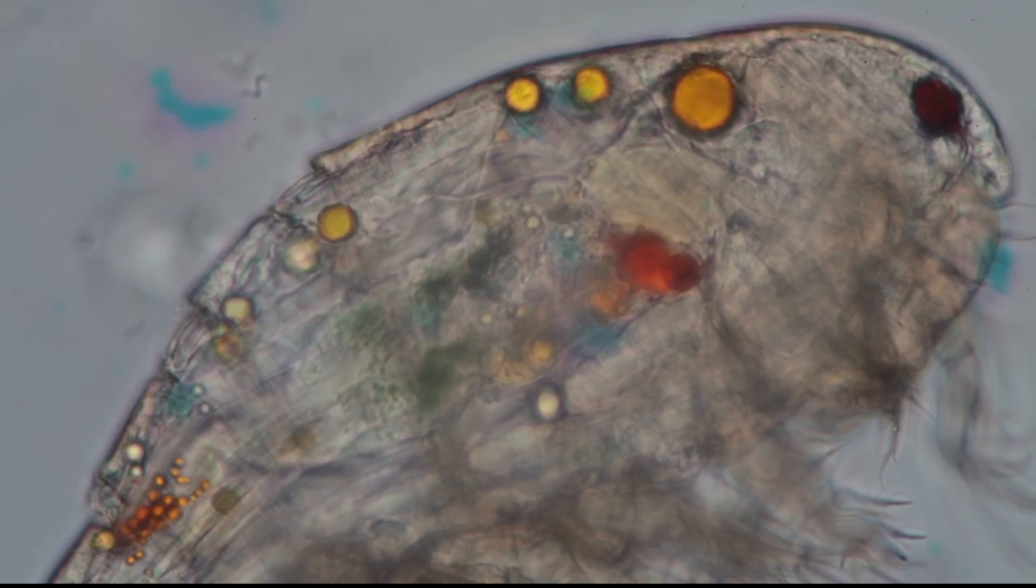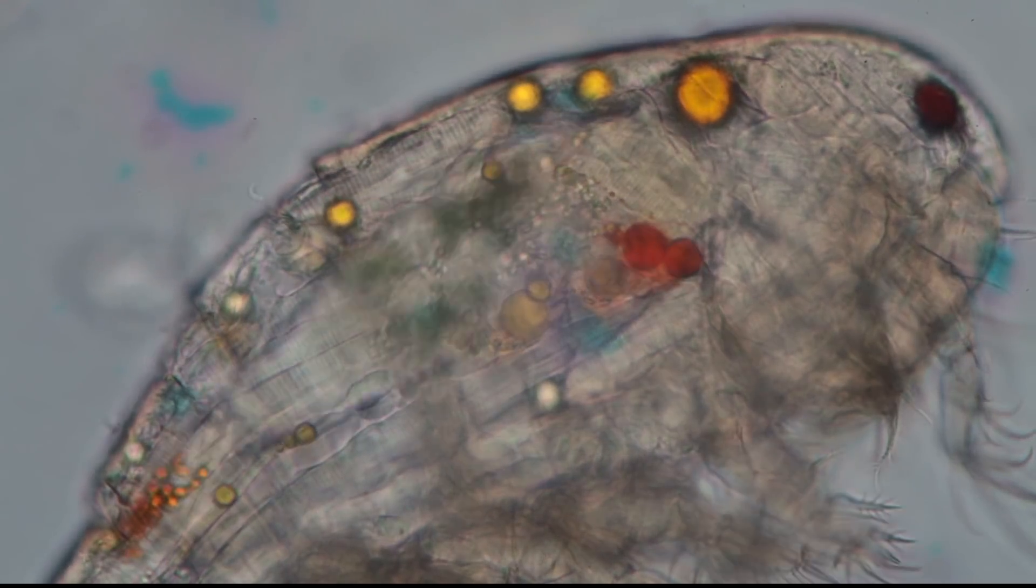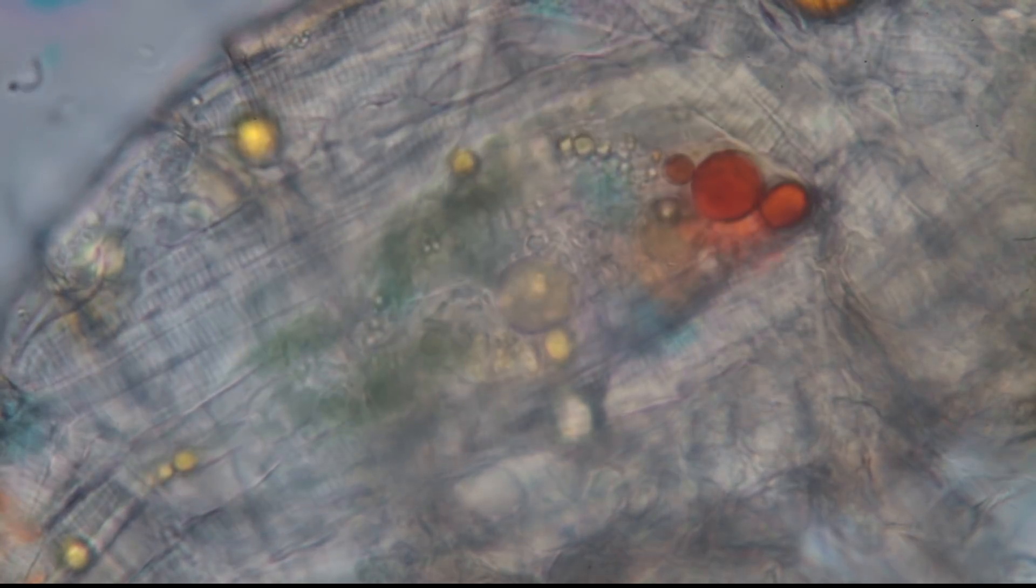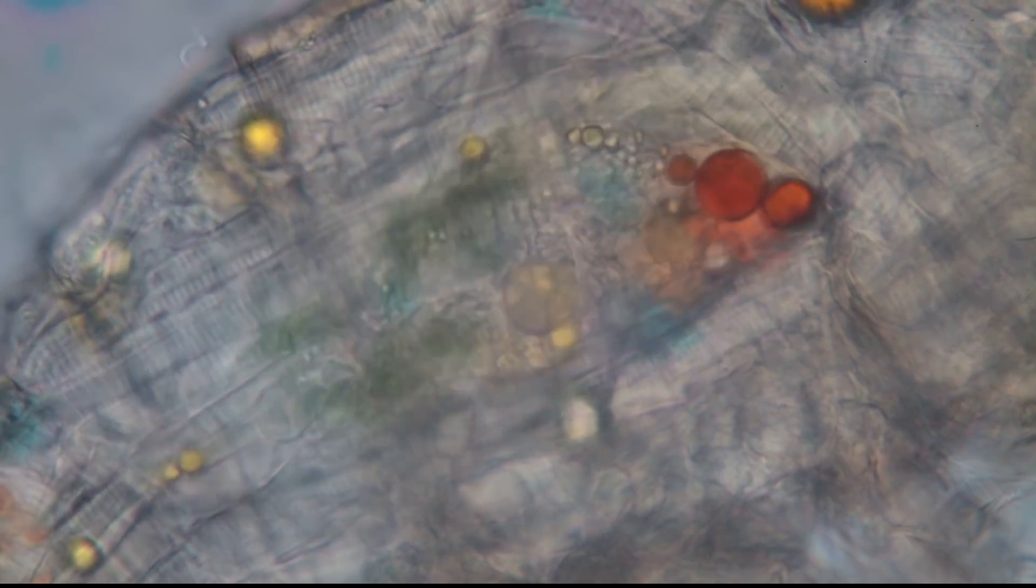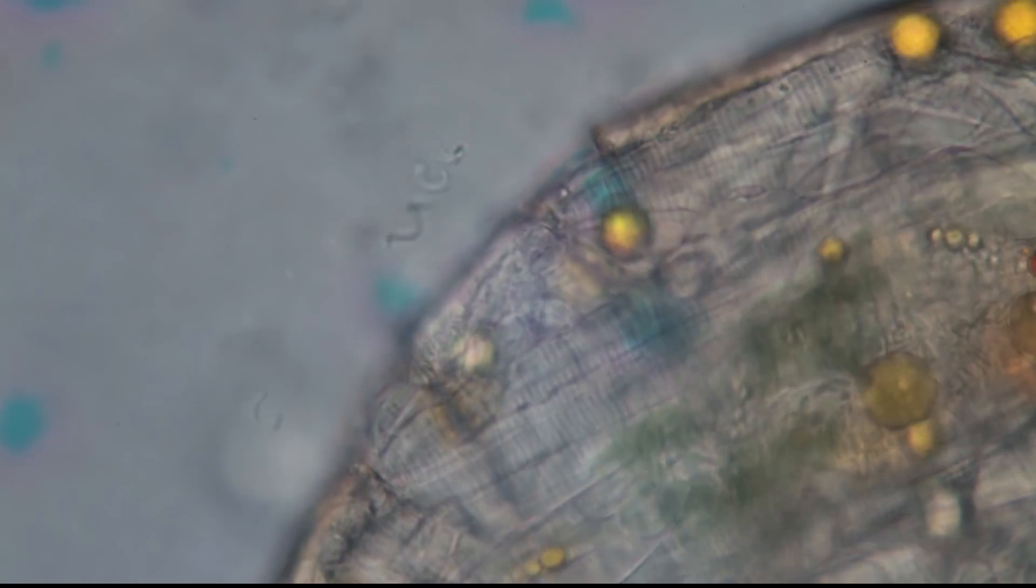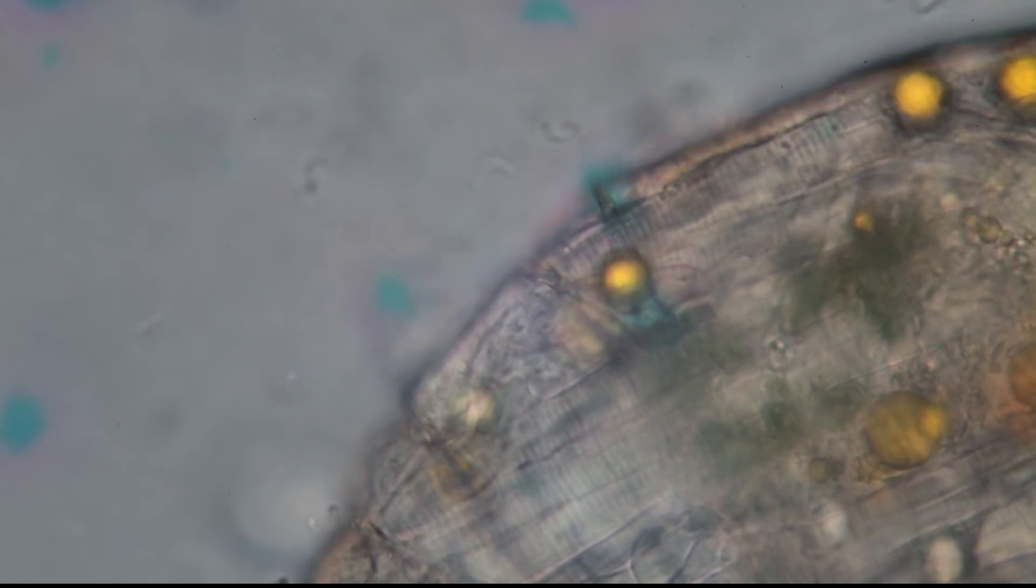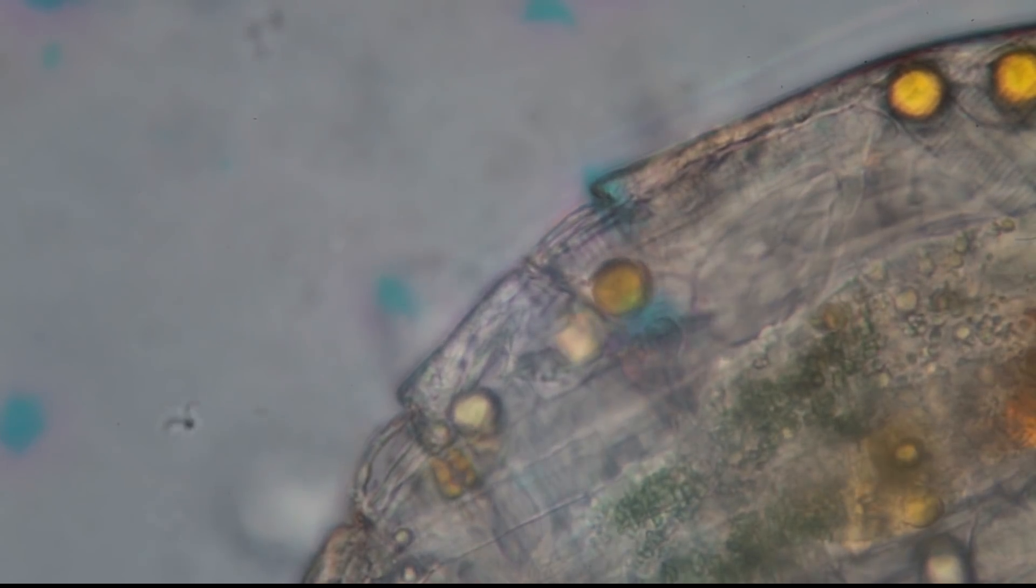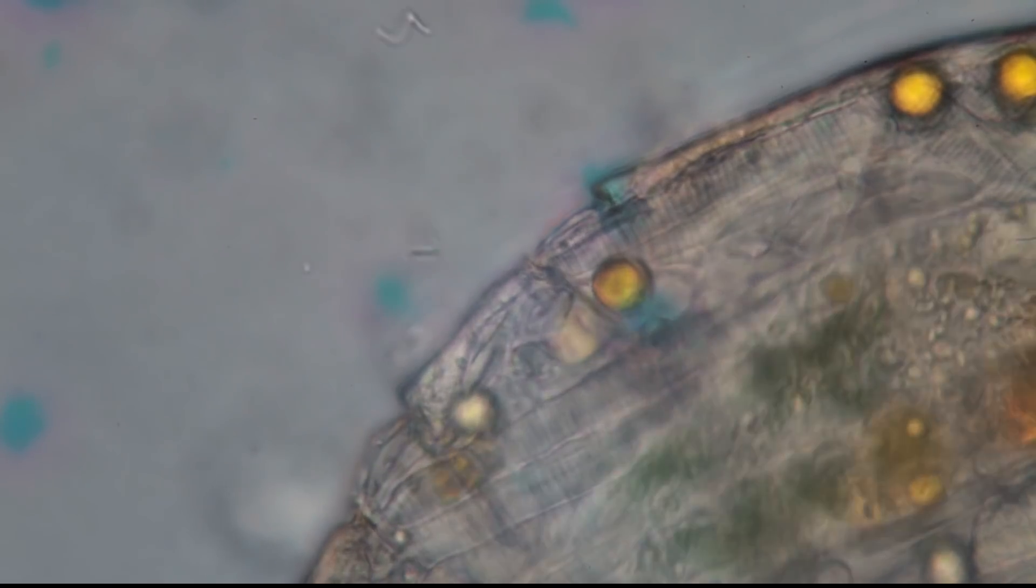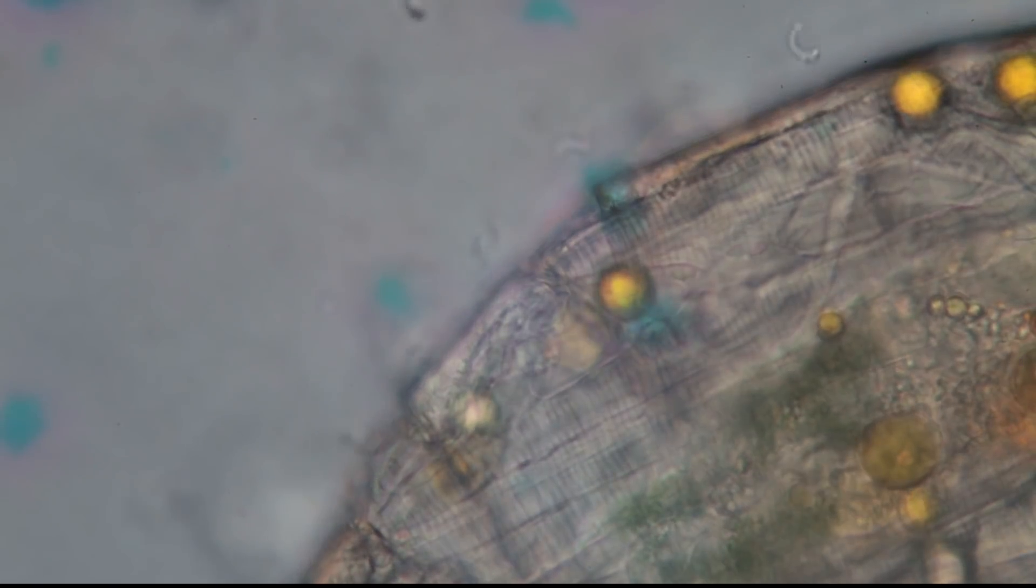And what they do is they suck in the water with all the suspended particles. And they basically filter out the food from the water. And this way they also keep the water clean. So I'm actually going even to a yet higher magnification. And now we can already see the spirilla quite well here on the back. And they are swimming around. They are moving forward by turning like a corkscrew bottle opener. And this is now in real speed. So they are moving quite vigorously.